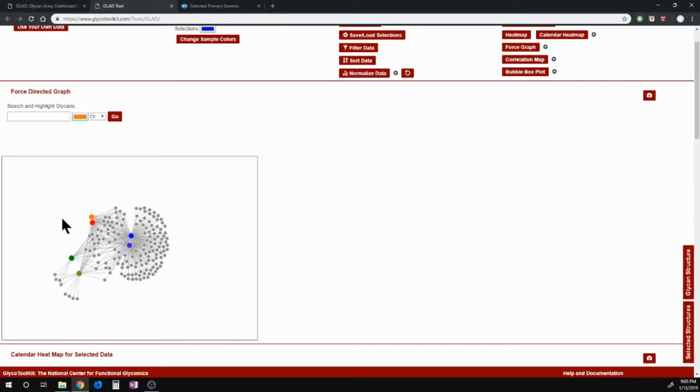Notice that this has also clustered the data in a very unique manner. And you can see that galectin 7 data for both 5 microgram as well as 2 microgram group together or cluster together, whereas the galectin 3C clusters together over here and the galectin 3 data clusters together over here. So it's fascinating that this tool is able to quickly tell you which are the pairs of proteins which are actually truly similar to each other.